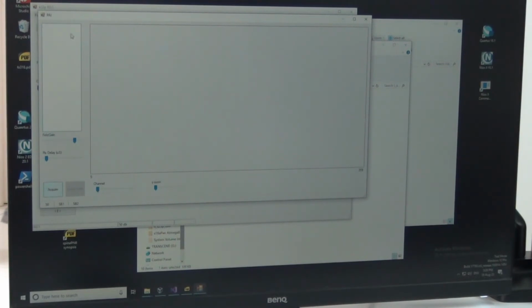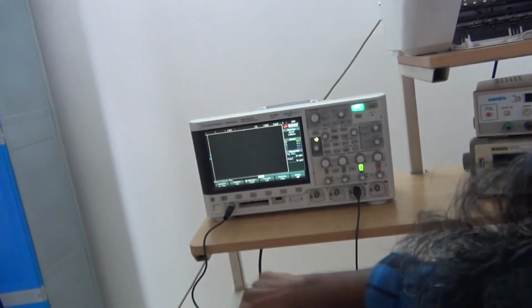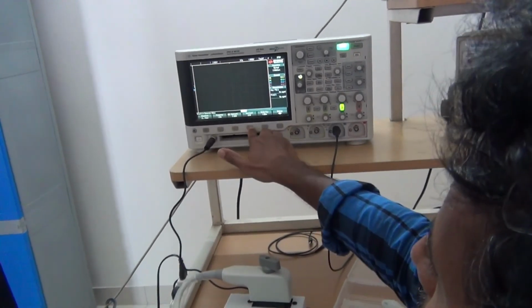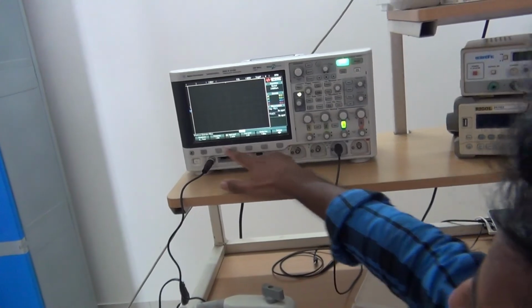So it's waiting for the photoacoustic laser trig to come in. If there is no trig, it just says timeout. So once again I'll click acquire and give a signal generator pulse. What I am giving is through this pulse generator feeding into the laser trig, I am giving a 3.3 volt pulse high and the low level is 0 volt. 1 microsecond wide pulse I am giving.